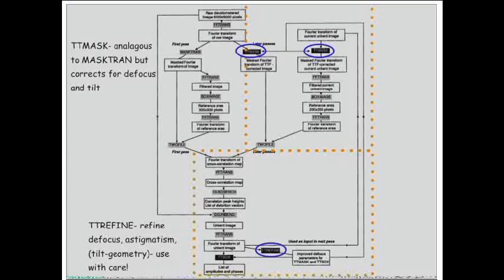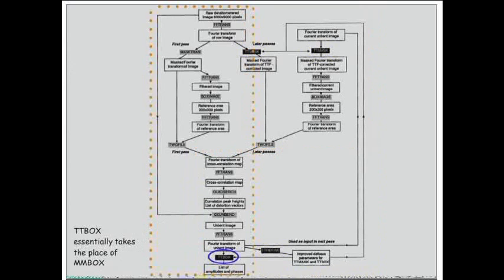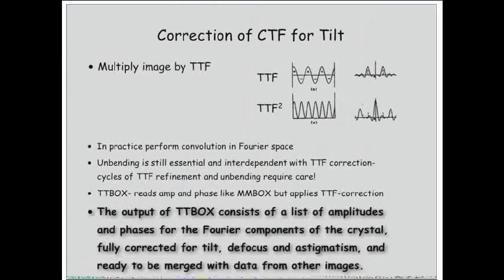But you've got to be very, very careful. Again, be really, really careful when you're doing this. Don't do it blindly, automatically, assuming that it's doing the right thing. Particularly, for example, if you think of this tilt transfer function, if you don't get this right, you see how it's sinusoidally varying, it's repeating.